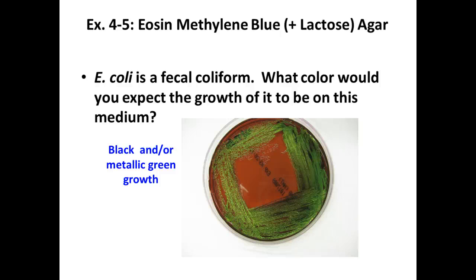You remember using these plates before? Yeah, I was about to get to that. Oh, sorry. So we used these plates once before when we did our counting activity. And do you guys remember that we had E. coli? So you've seen this color before, right? You just didn't know what you were looking at and why. The couple plates that we had were kind of a confirmation that we didn't really have contamination, that we actually had E. coli growing. And a lot of times when they do these, they do it because they're specifically looking to count just these guys as opposed to any other bacteria.